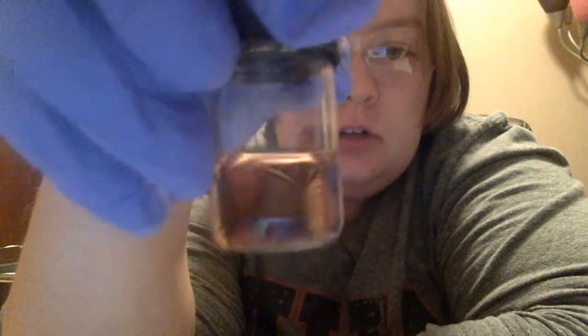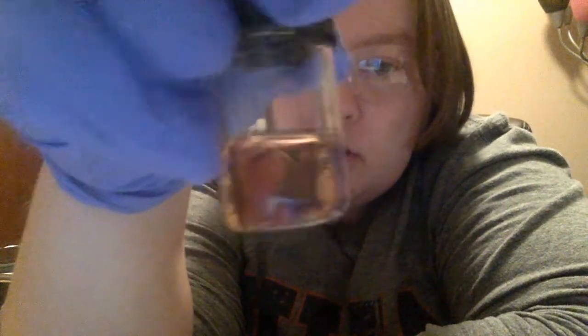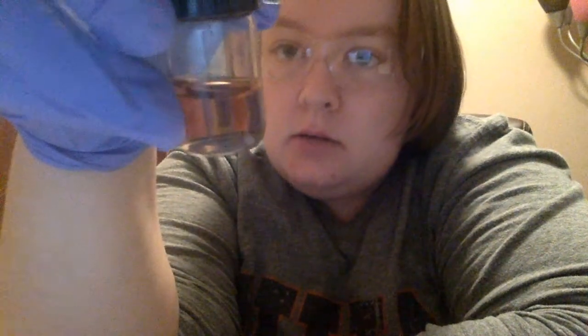So think about that. And the last question, what other characteristics of ruffinotoxin can we use to separate it from other proteins that are close in size? What these questions are essentially saying is, this is a brownish colored liquid. There could be multiple things in here. Because ruffinotoxin is 13 kilodaltons, there could be something that's 13 kilodaltons in here. The ruffinotoxin could be in here, but it could also be mixed with something else that we couldn't separate very easily.